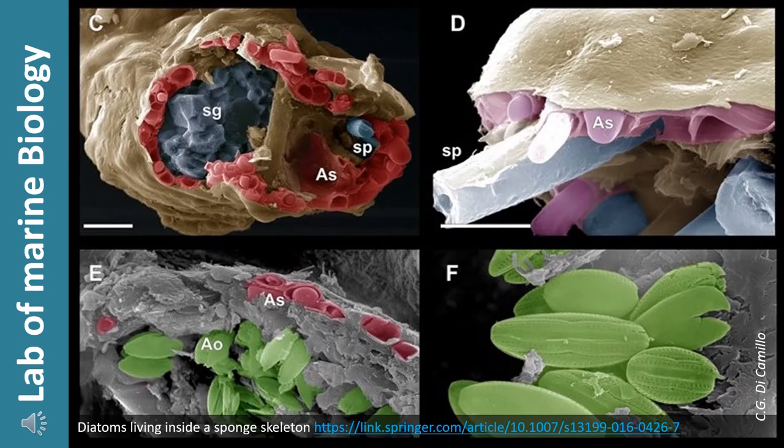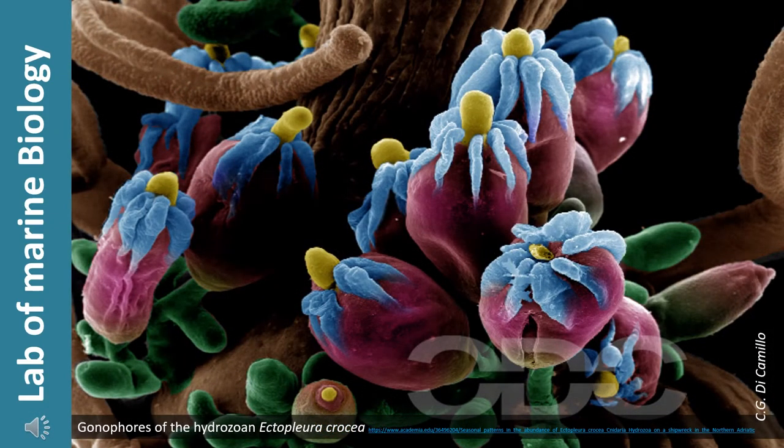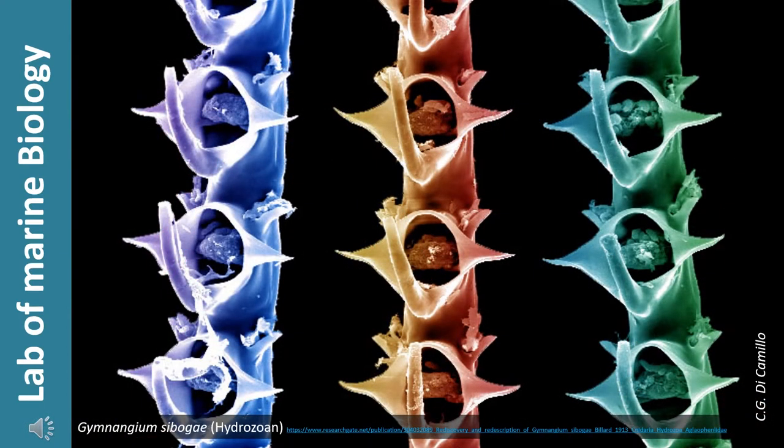Here, you can see diatoms and macroalgae living inside a sponge skeleton. Microphotographs at the scanning electron microscope are in black and white. However, it is possible to recolor images using photo editing software. In this picture, you can see flower-like reproductive structures of a hydrozoan. Here, a modular pattern of a thecate hydroid is evident.